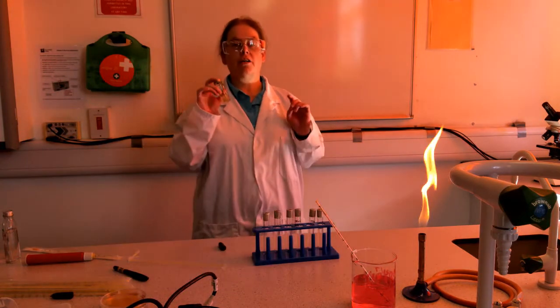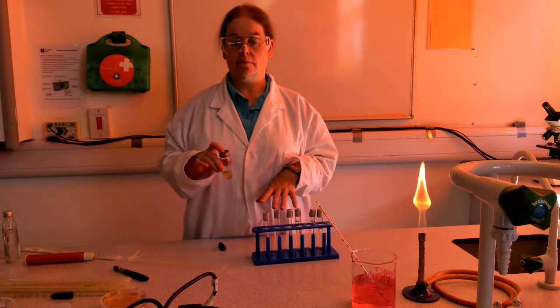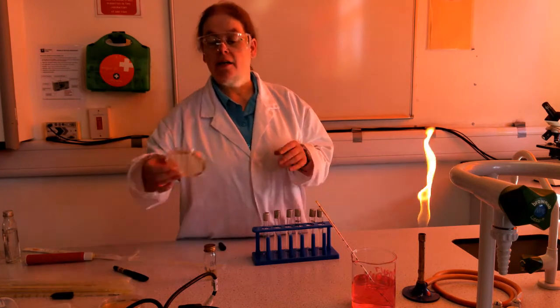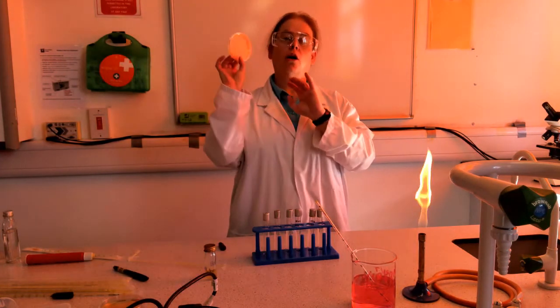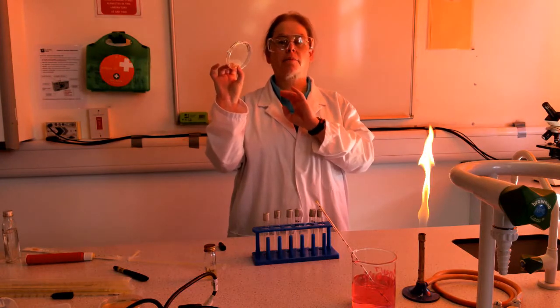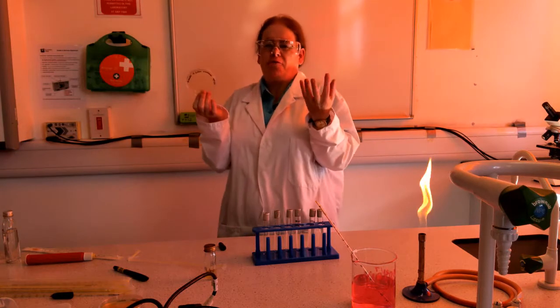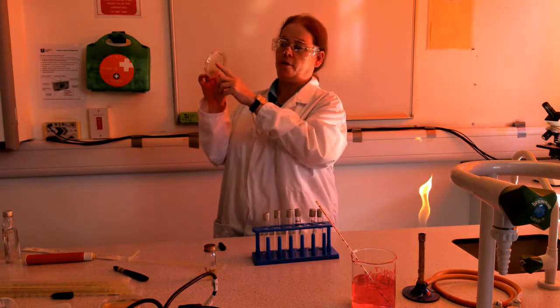But basically what we are going to do here is take this culture and dilute it 1 million times in sterile water. When we've done that, we're going to spread that 1 million times dilution on an agar plate. And because we've diluted it 1 million times, it'll just be a few dozen maybe bacteria. So it'll be like one bacterium there, one there, one there.